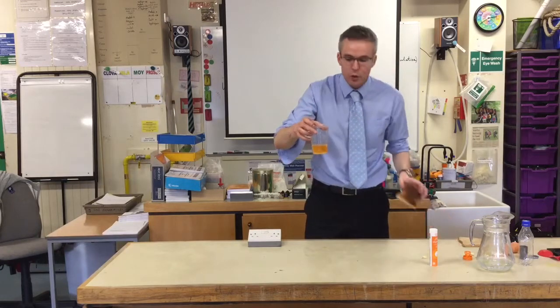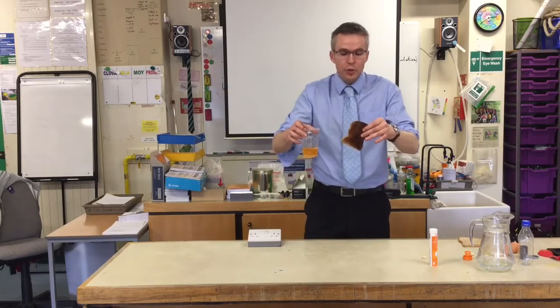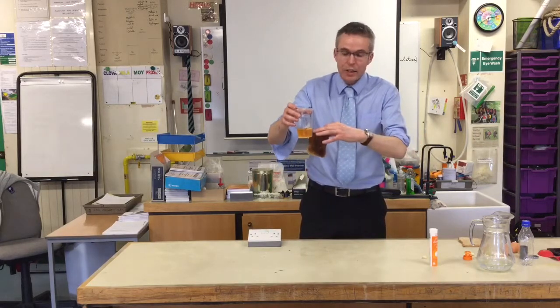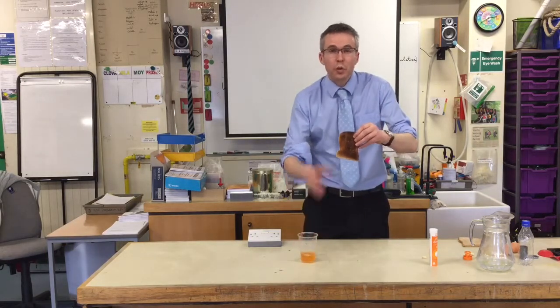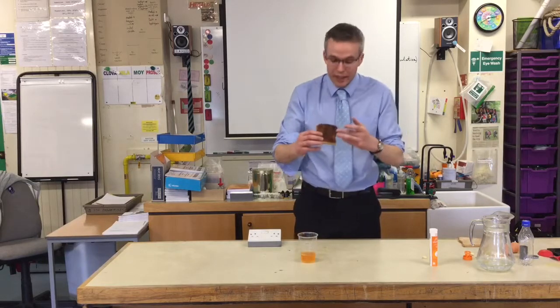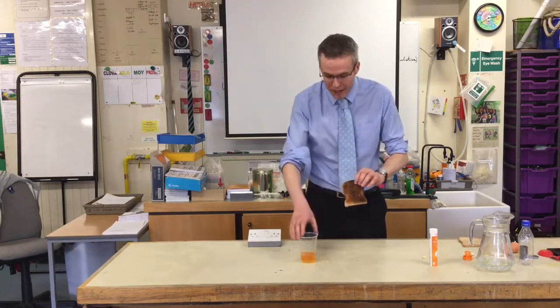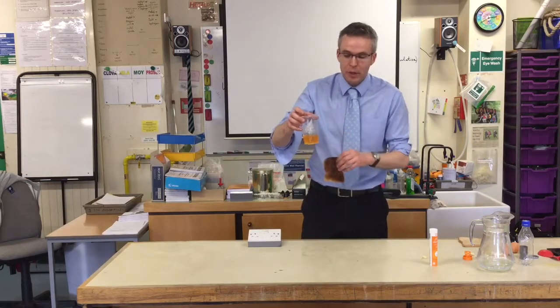If we just compare that to the toast that I explained earlier, if you were making toast, you would see it starting to brown, or in this case, burn, which again is a colour change. A bit like here, we're getting a colour change. When you make toast also, you can very often smell the toast as it's burning in this case. And again, that's gases being given off that you're smelling. So again, you can draw a comparison with the toast that you've possibly introduced earlier with this experiment here.